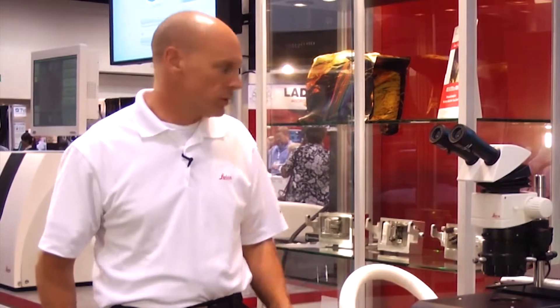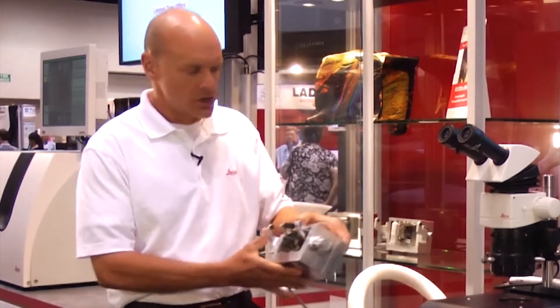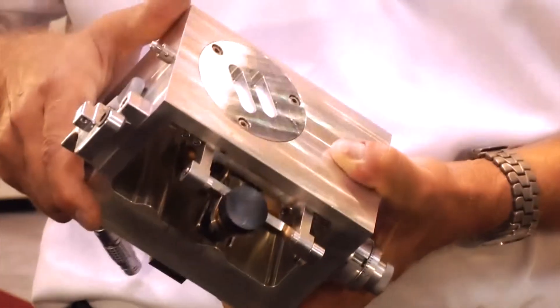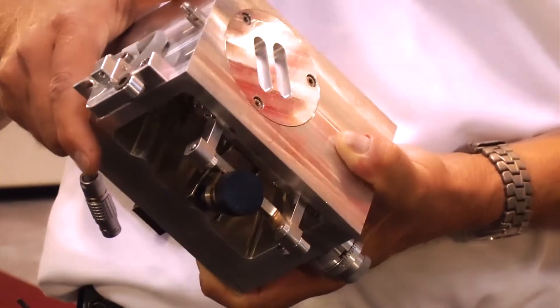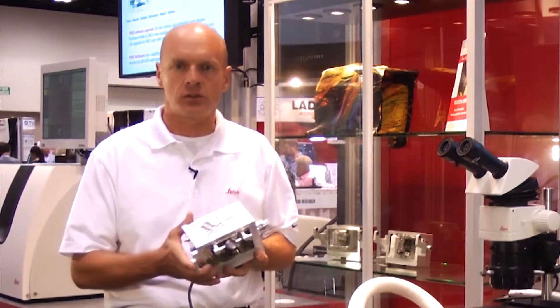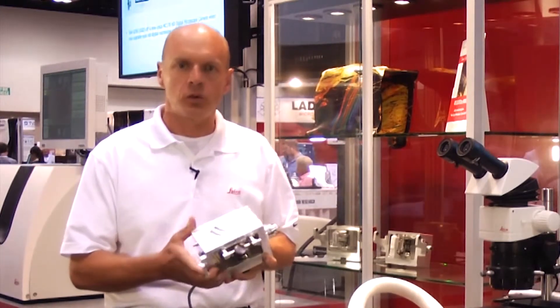Additionally, we have a new stage that's being introduced here at M&M which will mill samples across a large broad sample. We have a sample that is as wide as 25 millimeters in place, and we can polish the entire surface of that within a few minutes.